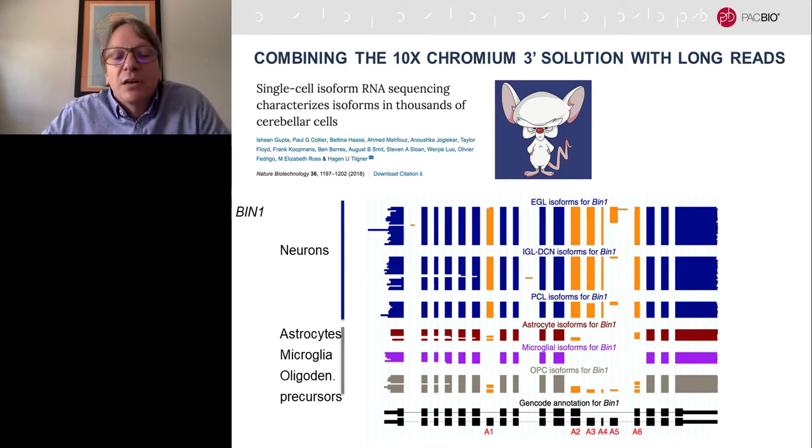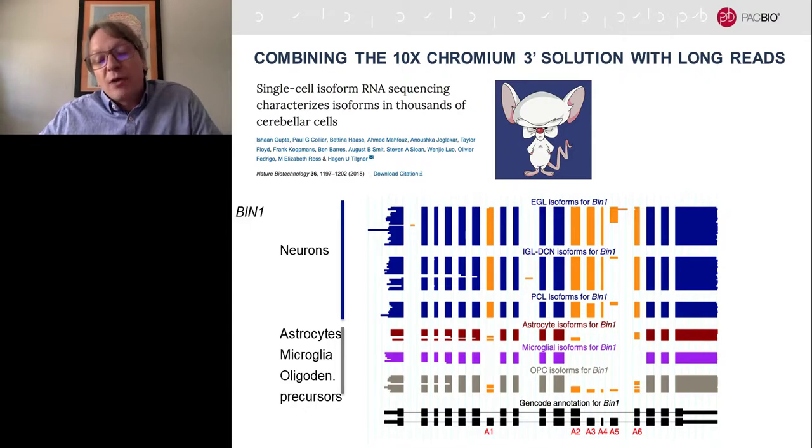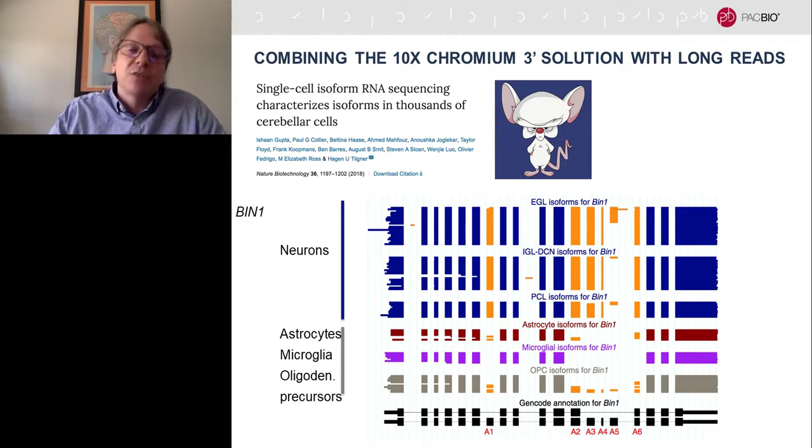included as often. And if you look at the GENCODE annotations below, these are known to be alternative splicing events. But now with this technique, they could take advantage of this information to track which isoform is in which cell. And the brain's an extremely exciting place to do this because there's such diverse alternative splicing and cool biology behind that.